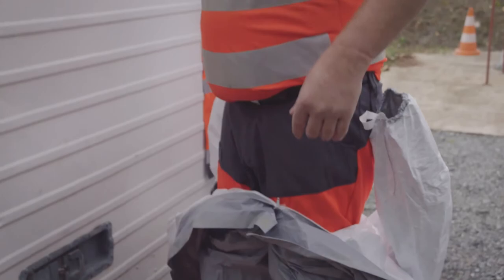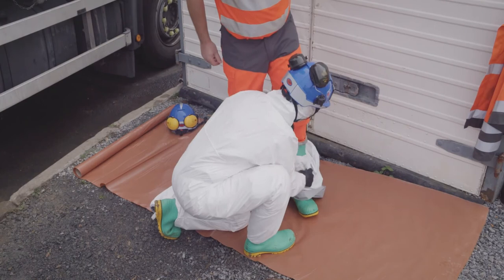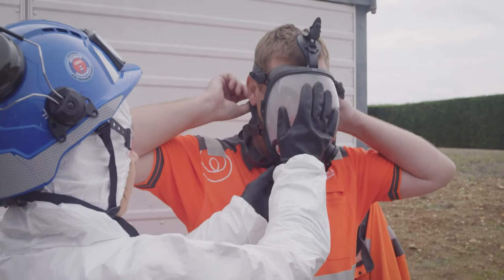The colleague takes hold of the gloves with the arms of the coverall in order to remove them. Then your colleague uses the coverall legs to hold the boots and helps you take them off. Be sure to place your feet on an uncontaminated surface. The colleague then removes the mask.